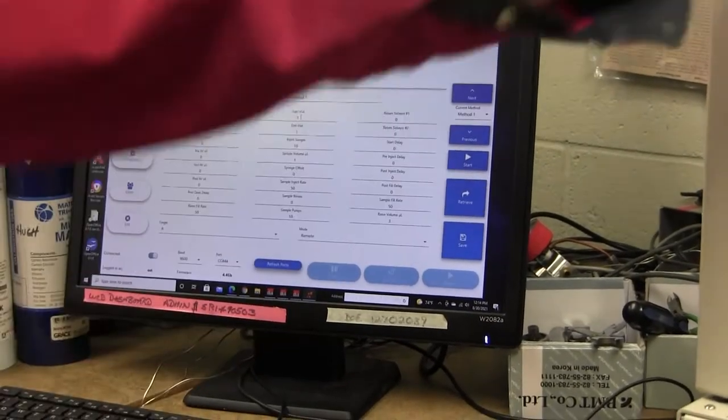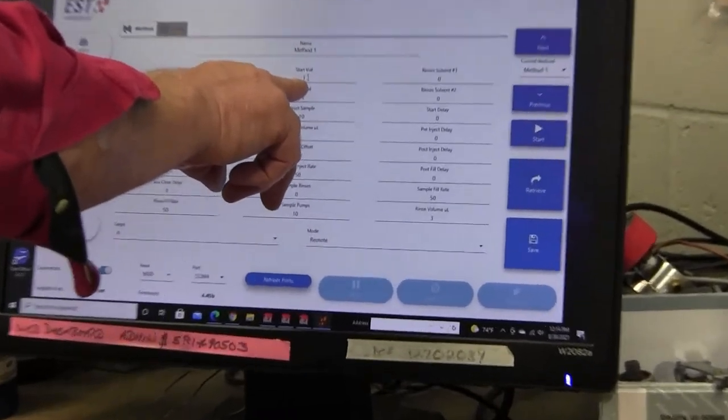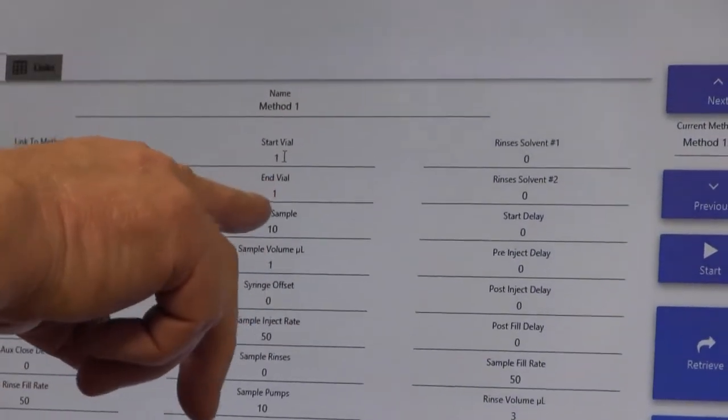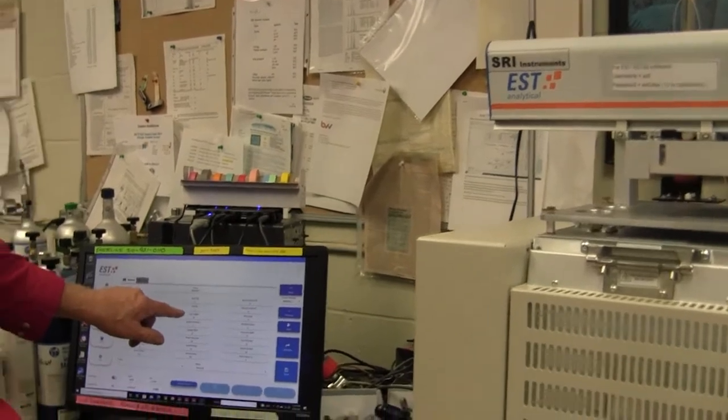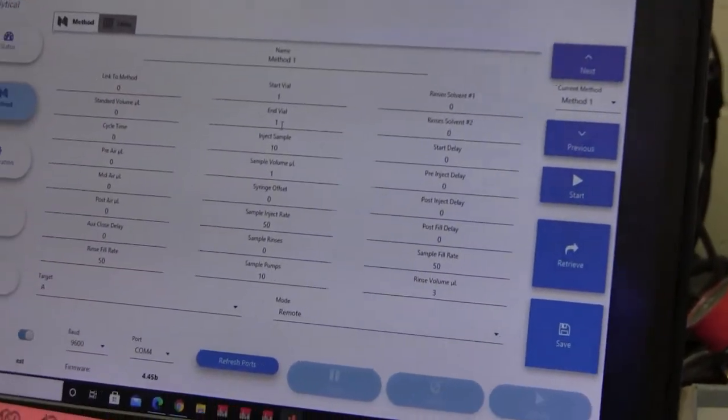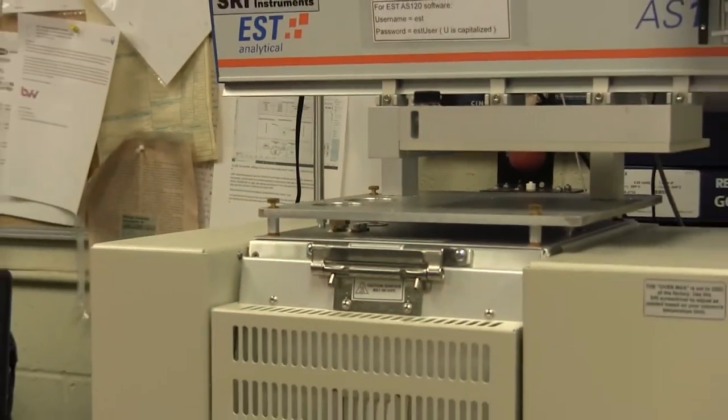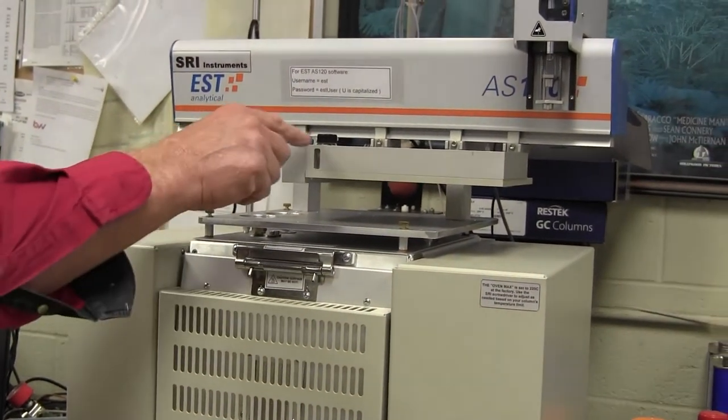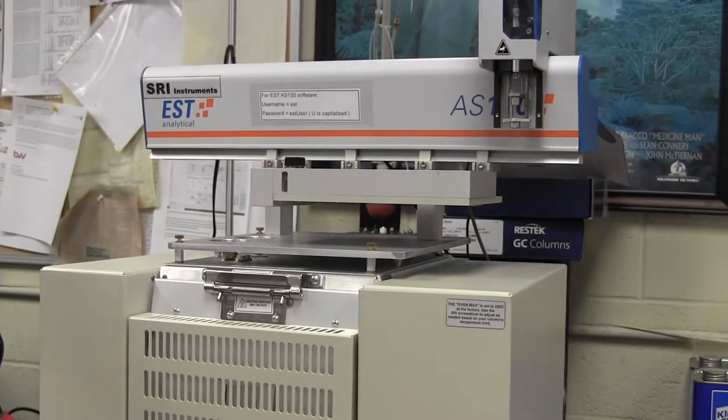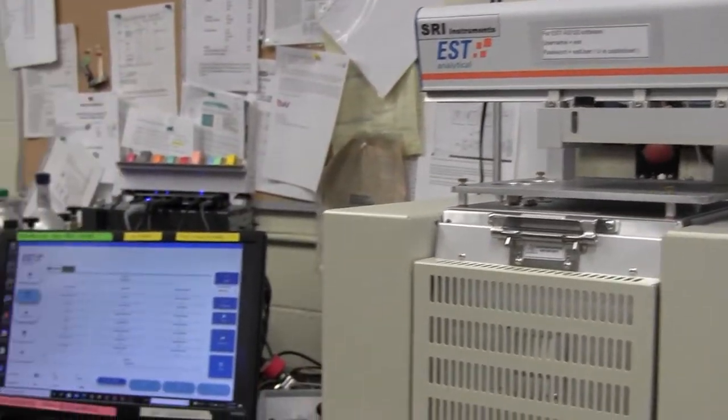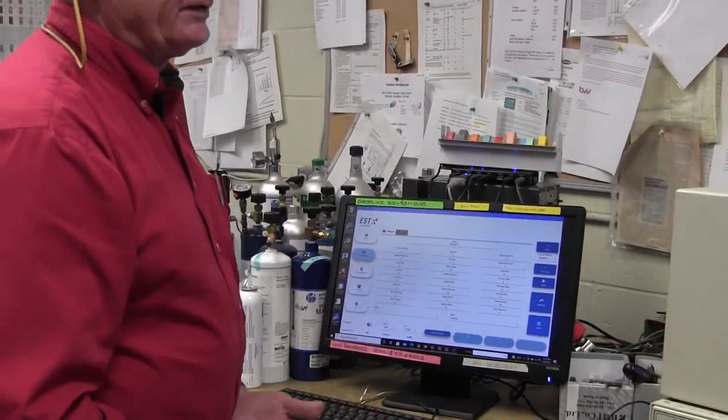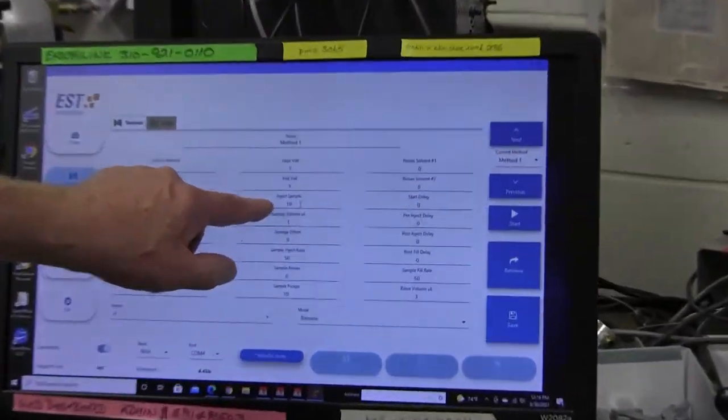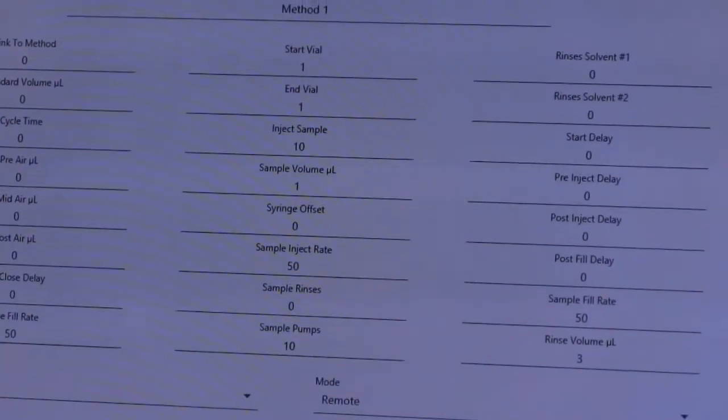So right now it's set to start at vial number one. And then you need to tell it the ending vial. The ending vial could be any one of the 120, but the ending vial that I've chosen is also vial number one. I'm doing this because I'm just going to take a sample over and over from vial number one. And this is how we demonstrate the reproducibility of the GC and the auto sampler is we just repeatedly inject the same sample and then we get the answer and we calculate the standard deviation to determine the precision of the overall system. So that's kind of what I've got set up here. And I've told it to make 10 injections from the same sample bottle.